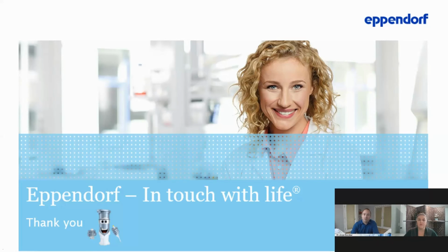As I explained, Professor Robert Spiger has performed all these studies in his lab, and we adapted the best possible conditions for us to mimic or reproduce the iPSC aggregates formation in our laboratory. That's why we use a pitched-blade impeller configuration. I see. Okay. Thank you.